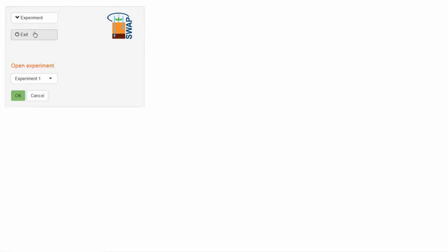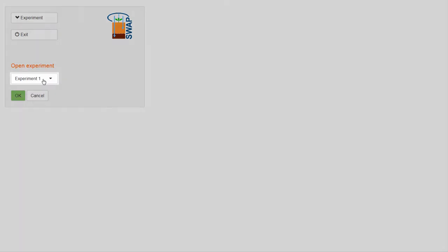Select OPEN and choose Experiment 1. The default experiments that are available to you here will depend on which SWAP package you have.